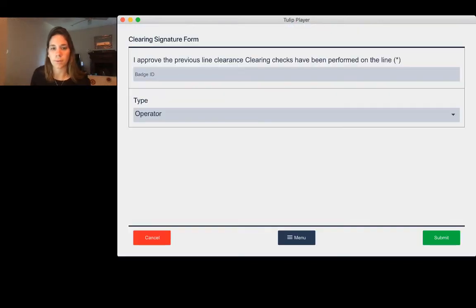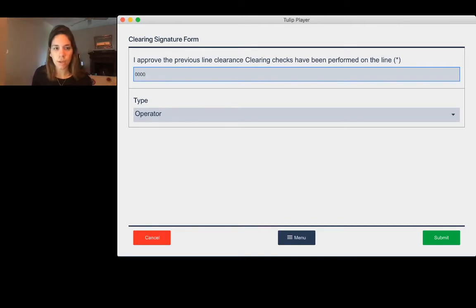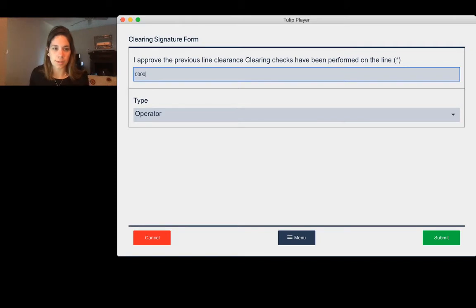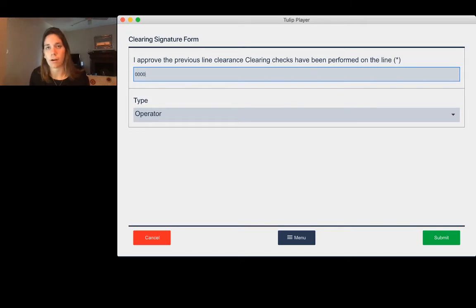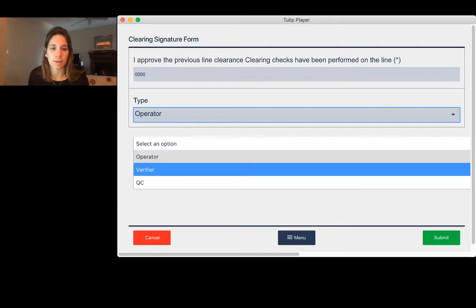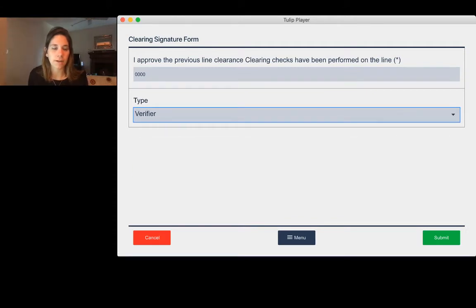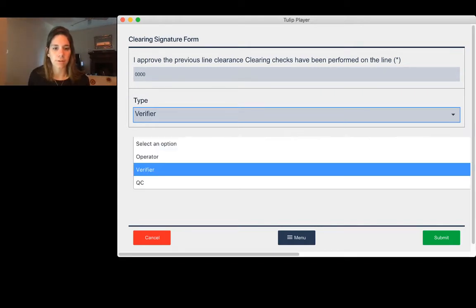You go ahead and click submit, and then it walks us through a signature form. This again you can customize. This is asking a double confirmation of the operator, but since the operator is locked in, they're already being stored with the information. You could change this to be like a verifier, and you could set up the logic to make sure that the person who is signing this form, that the badge ID matches the verifier.